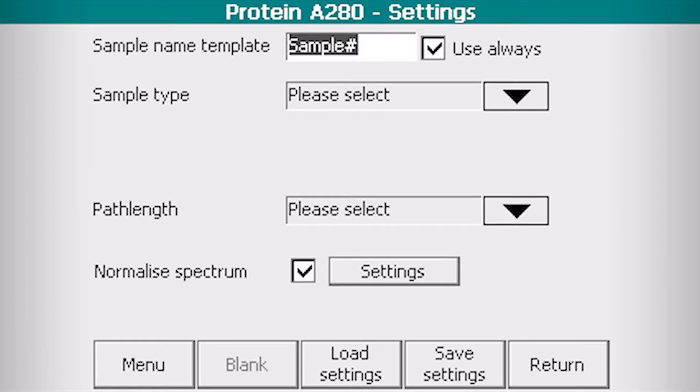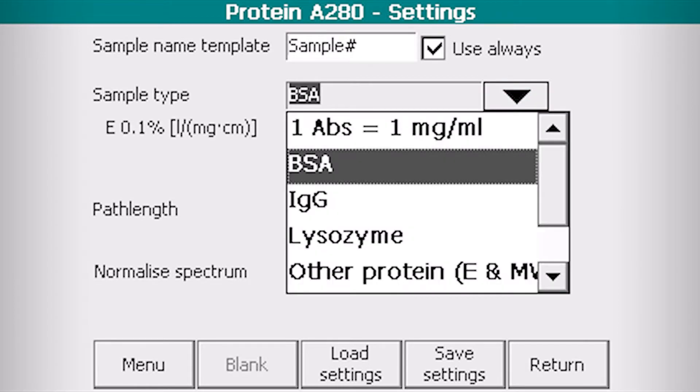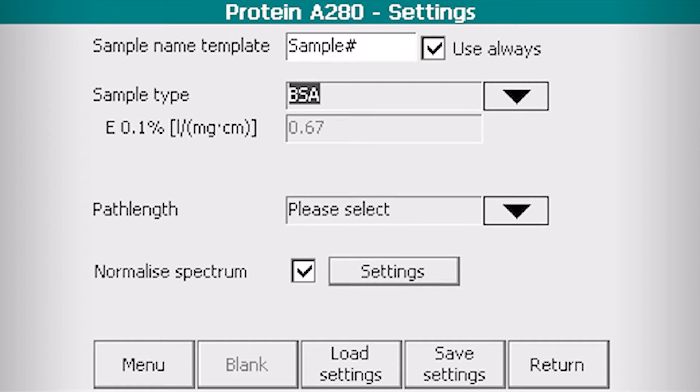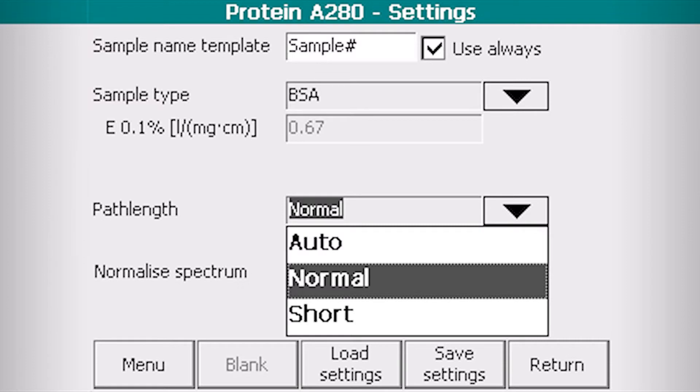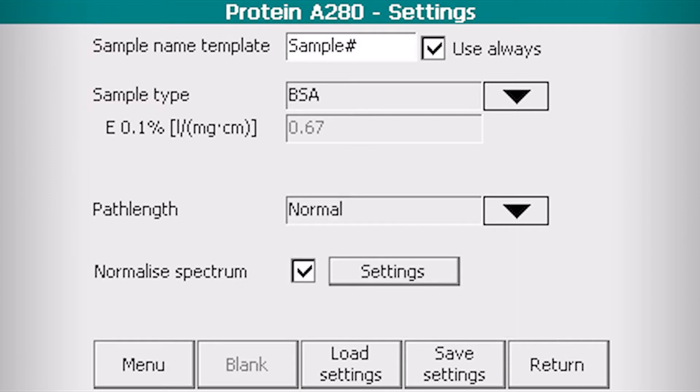You may edit the sample name. The sample type must be selected for the proper calculation of concentration. The path length must be selected: normal for low, short for high concentrations, auto for automatic selection.